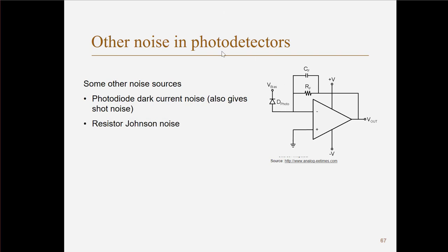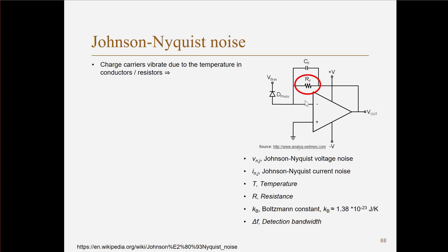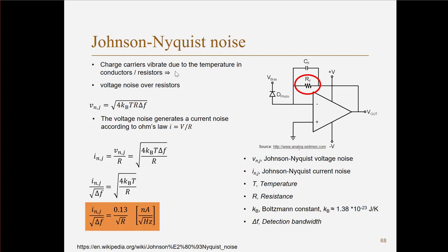The next noise source is resistor noise, which comes from this resistor. I will talk a little bit more about that. And then there are the transimpedance amplifier current noise and voltage noise. Now I have some slides about this. I will go through these very quickly because I think it's good that you have it. I just wanted to put it together somewhere, so that you have it together. Okay, let me just get this on here.